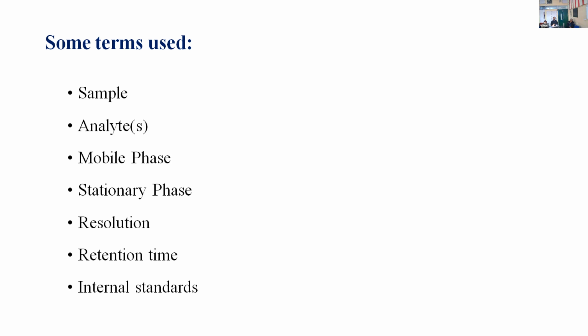It is the time between the injection and the detection in the detector. So it is called retention time.